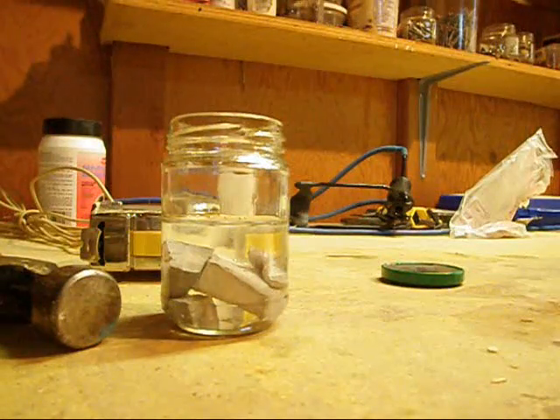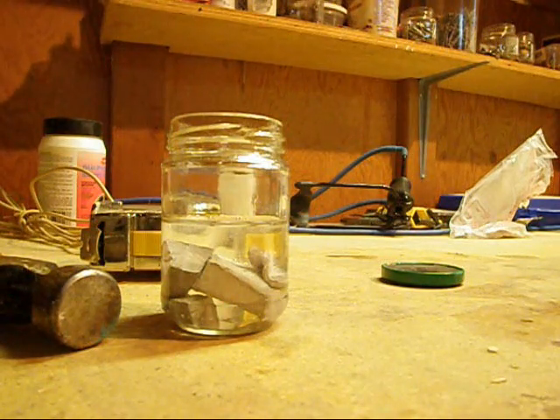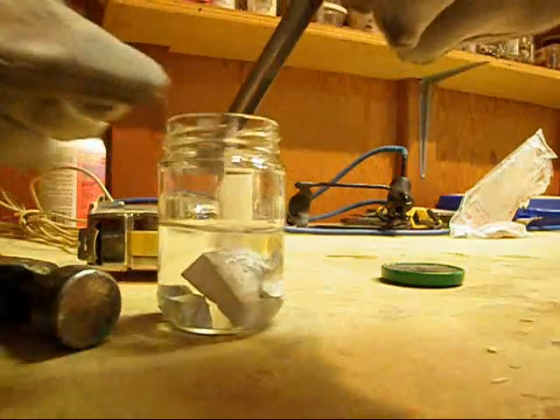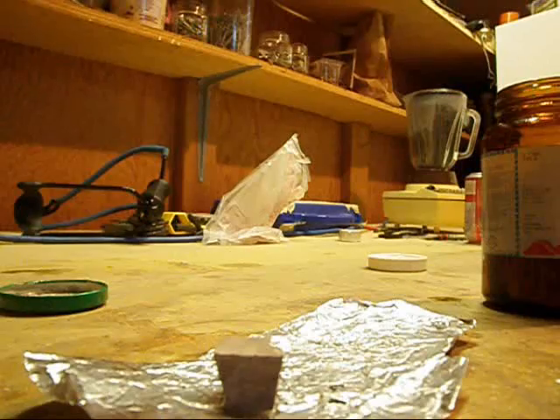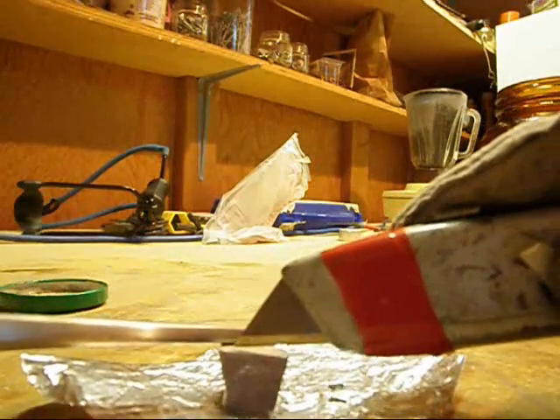This is going to be a video on the properties of sodium. Sodium is a shiny gray metal, but only when it's not covered in an oxide layer. And since it's so reactive, it is very quickly oxidized, which I'll show. When you cut into it with a knife, you can expose the shiny metallic nature of it.